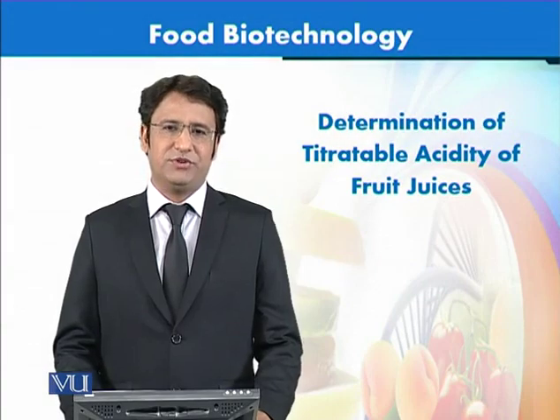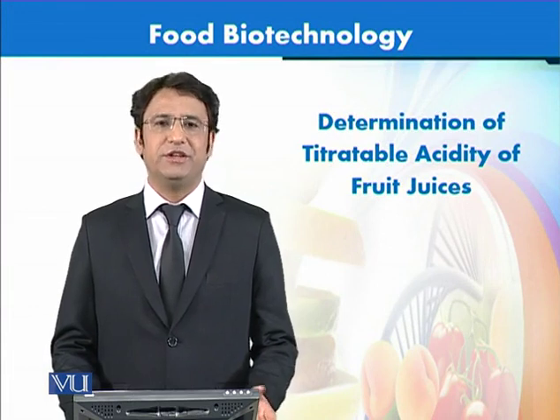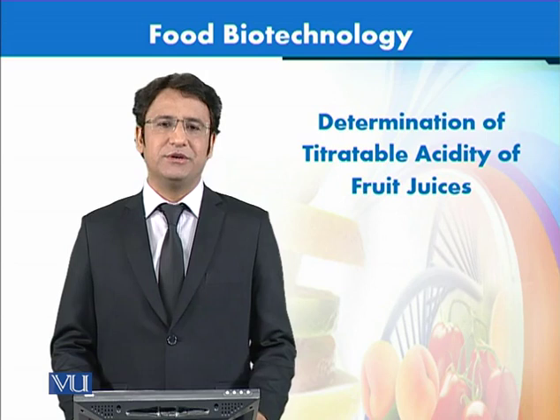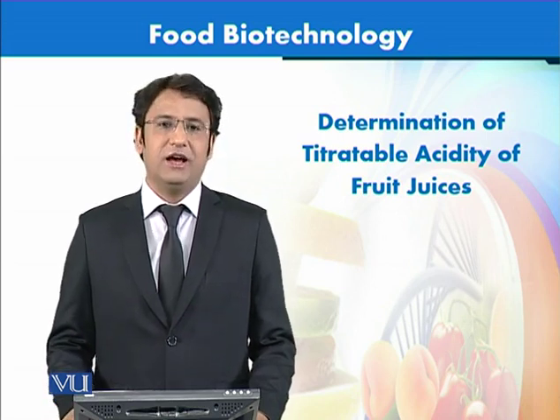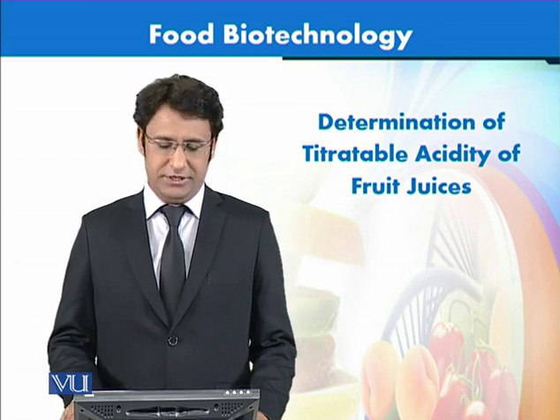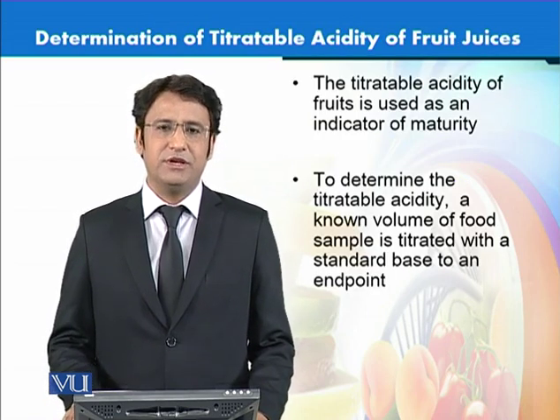Now we will discuss one of the very simple experiments that is generally done in the food industry, as well as you might have done this in your previous classes as well. This is the determination of titratable acidity of fruit juices. So first of all, let's see why we would do this analysis.